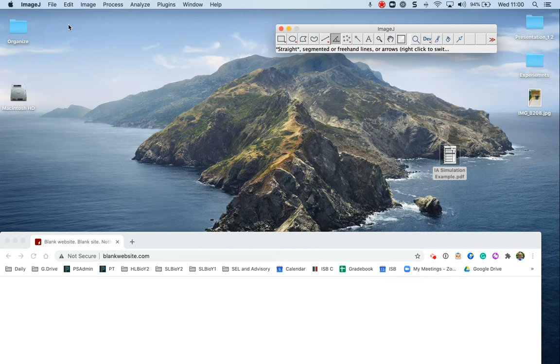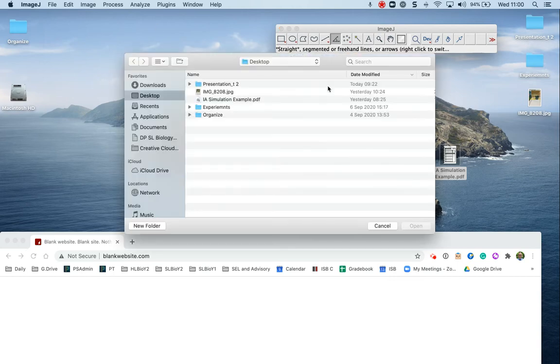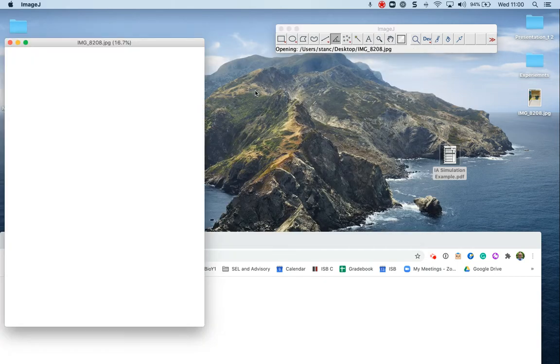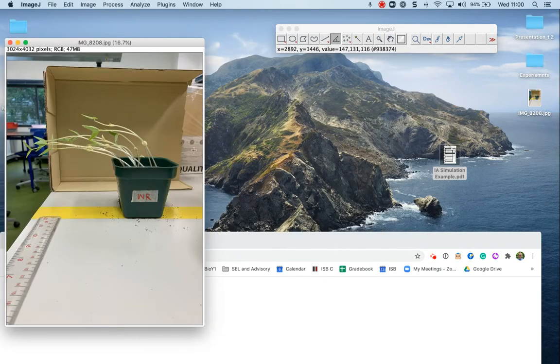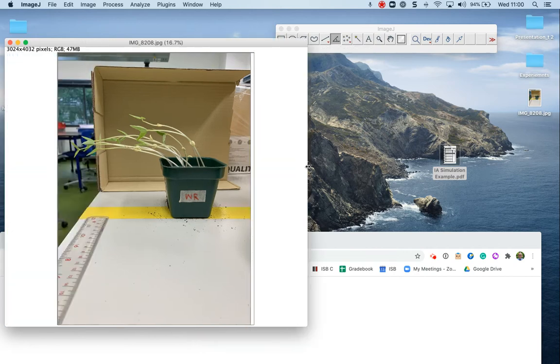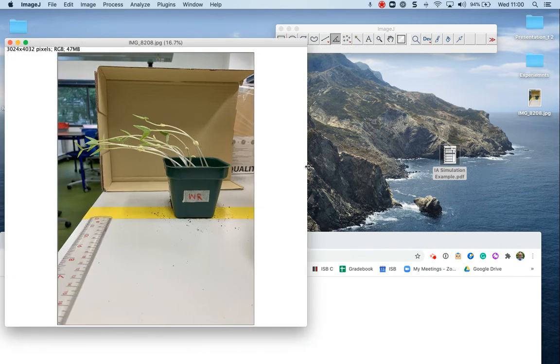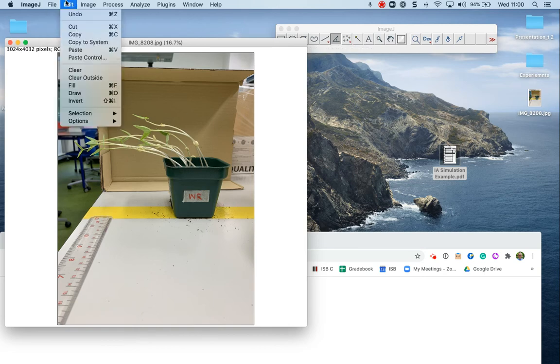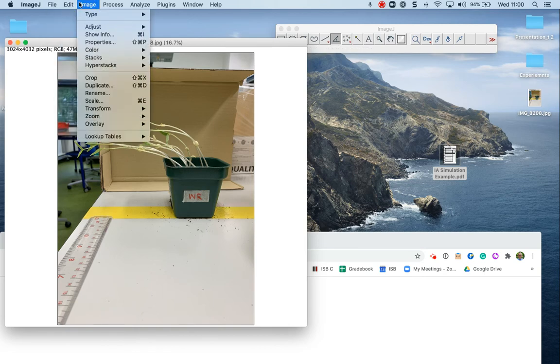So I'm going to open up a picture here. One of my students is looking at phototropism with different wavelengths of light. So this is one of her examples from her preliminary experiment.